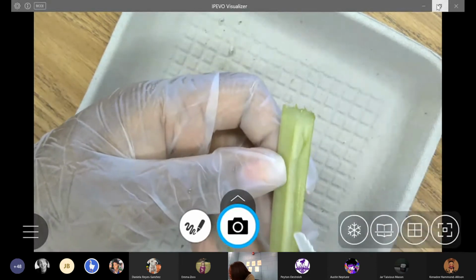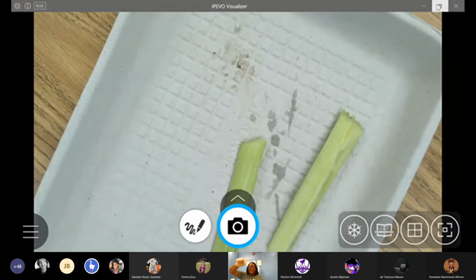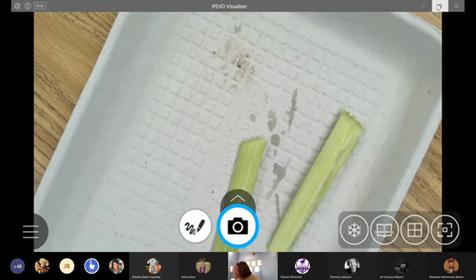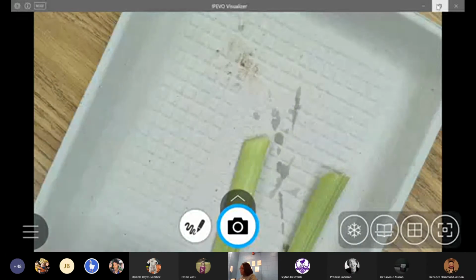You could pick out that tube and it would come out as a long string. And that string would look like a little straw because it carries water throughout our plant. So we'll go back to our big stalk here.